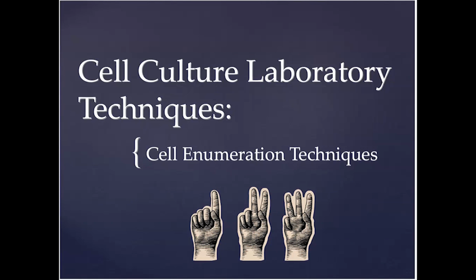Good morning, everybody. I hope everybody's doing well this morning. Today, I'm going to talk about a topic that describes techniques that are used in a cell culture laboratory. These techniques are used very commonly. They are referred to as cell enumeration techniques, but a better term is actually just cell counts.